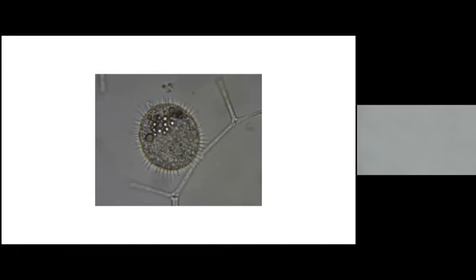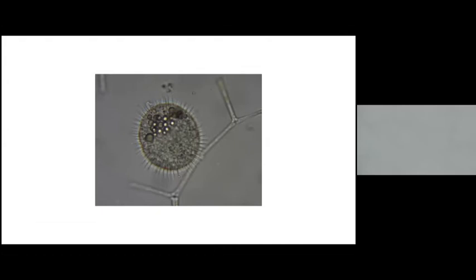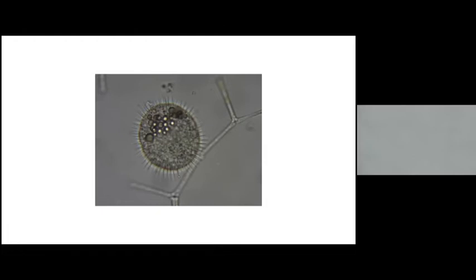So it looks like Nippon has a thought that maybe it could be a germ. These are great guesses, you guys. Can you zoom out? Oh, I actually can't zoom out. This is the entire thing. So, do you guys want to know what it is?